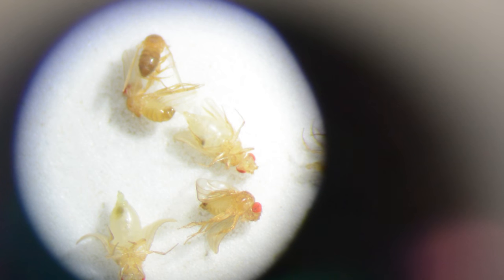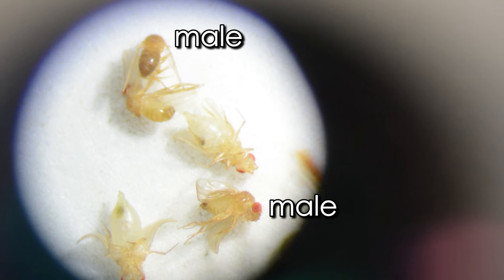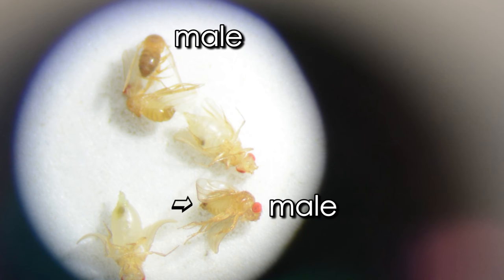What we're looking at now are adult fruit flies. We can start by showing the different genders — males are generally, but not always, smaller. You can often tell because males have a darker patch, whereas females tend to be a little bit lighter, but not always.